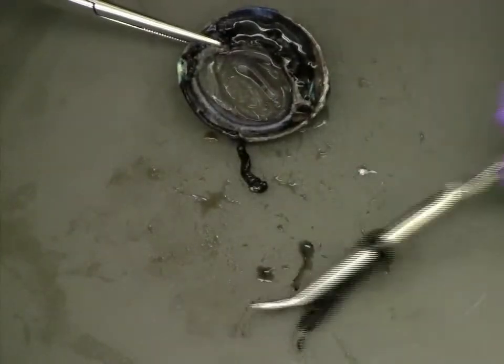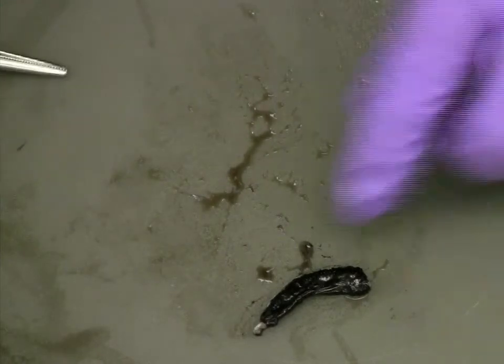Looking at the removed iris, the pupil, as well as the muscle that surrounds it, should be clearly visible.